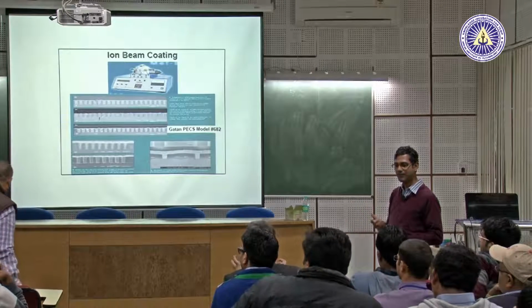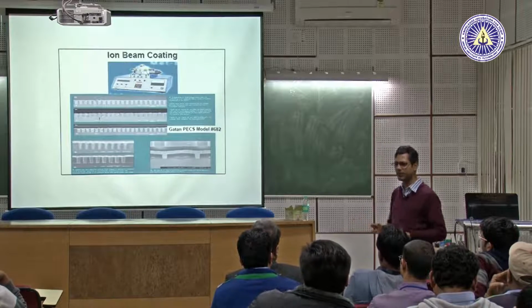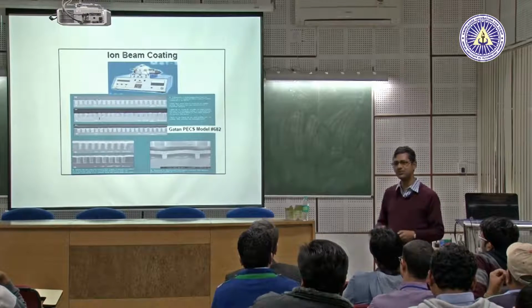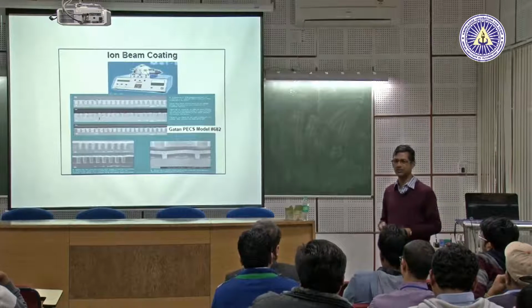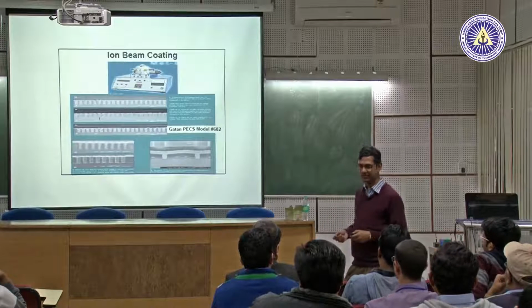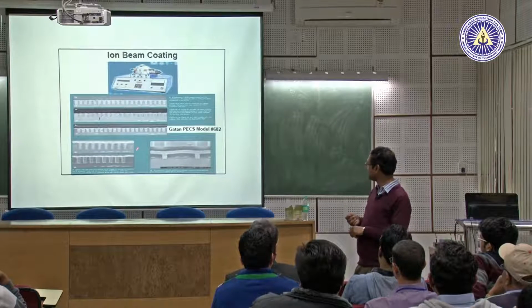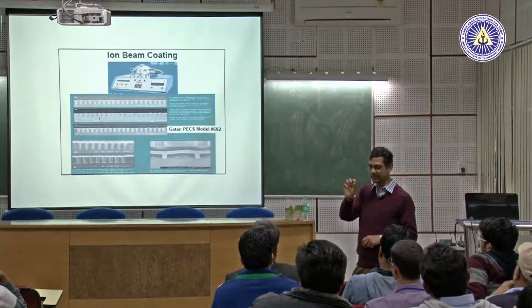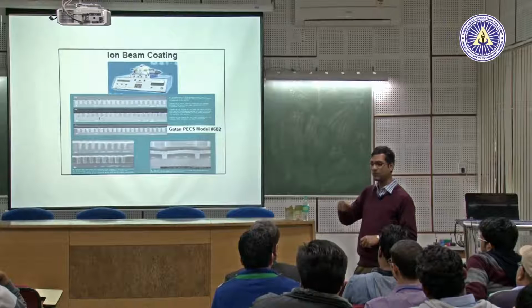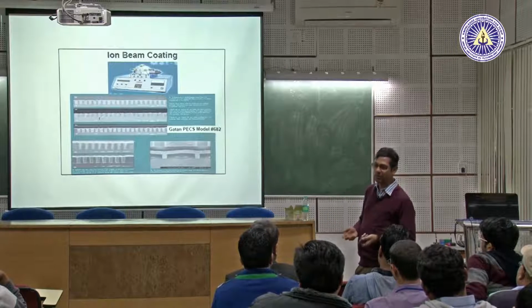You need to generate vacuum? Yeah, you need to generate vacuum, but not high. A rotary pump can do that. These machines come with all the SEMs nowadays, almost all. Even if you don't have, you can buy silver paste, available in the market, and apply the paste on the surface. The advantage with sputtering is that you can generate nanometer thick coatings, but by applying paste you cannot do that, it will be thicker, then you will lose some information out of that.